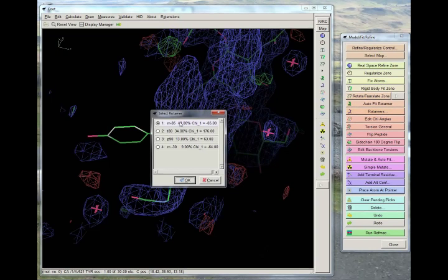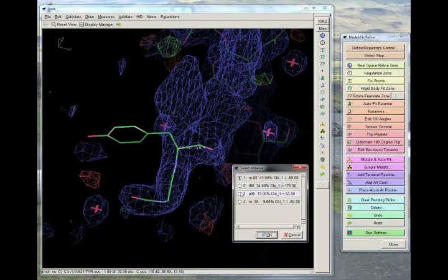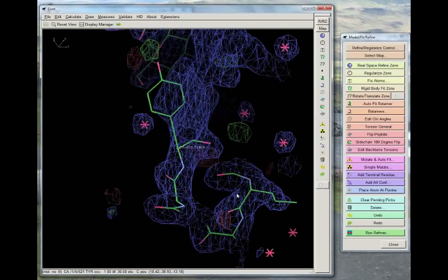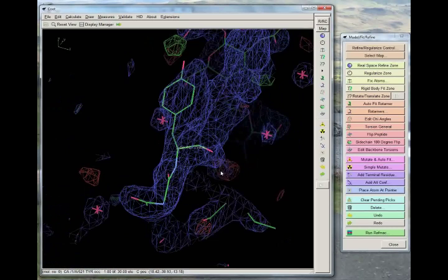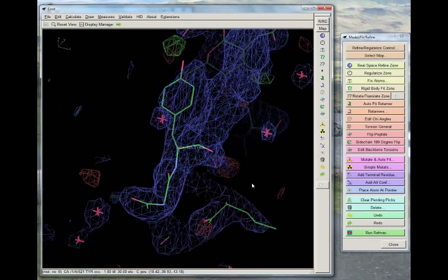and in this case it brings up a little box with the most likely positions for this side chain. So if we were going to do it this way, we'd probably decide that this one was the best and click OK. But this isn't actually that well fitted, and the reason for this is probably because the backbone isn't totally as well fitted as it could be either.